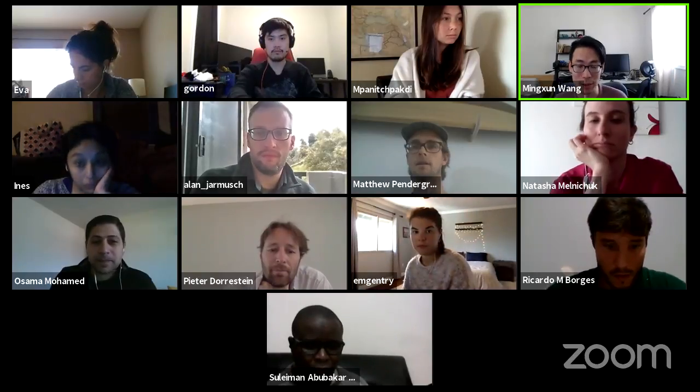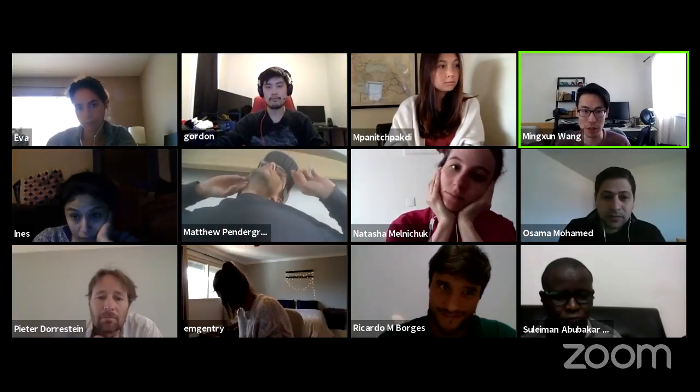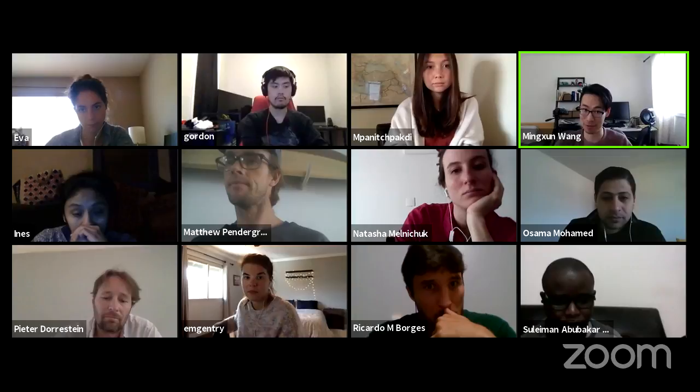One of the things that we're trying to figure out on our side is running MZmine on GNPS with standard batch files, like standard parameters for different platforms. It's not going to be the best of everything, fully optimized, as you're saying, but it's a place to start. So let us know if you want to try that out. That's kind of a side thing. That's very beta. So great, thank you.